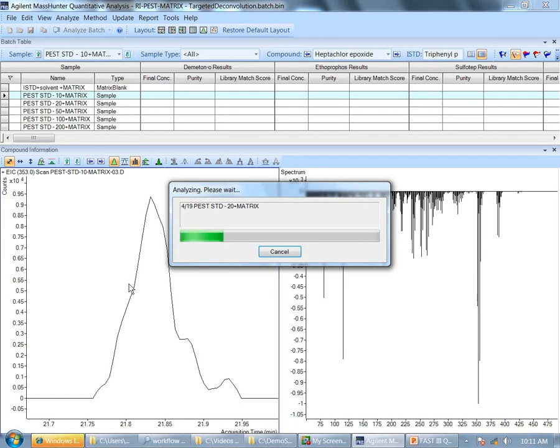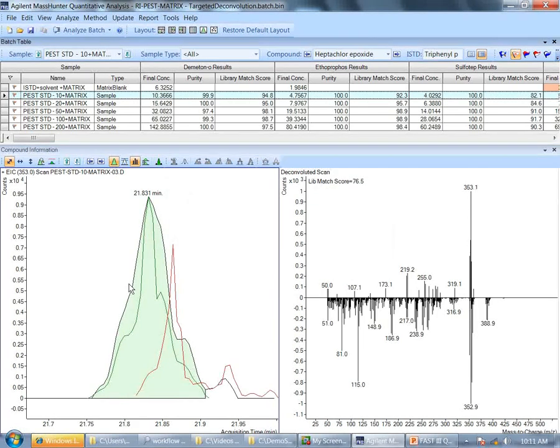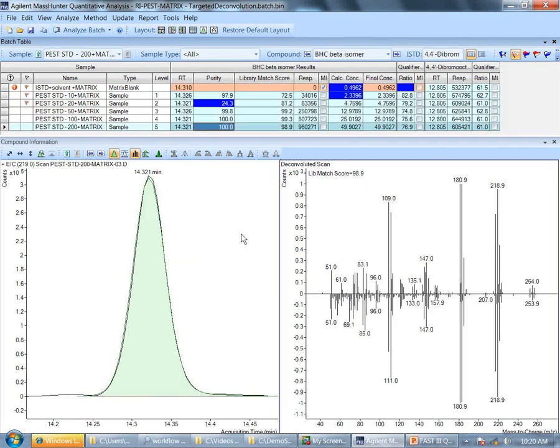The advantage there is that the spectral comparison is restricted to just the ions that are present in the reference spectra. And while this is computing, let me mention that we do have an innovative mechanism that provides an improved find rate of the targeted component. And not to be forgotten, the presentation in batch at a glance, which allows you to move and see the information visually. There are many interesting examples in this batch.